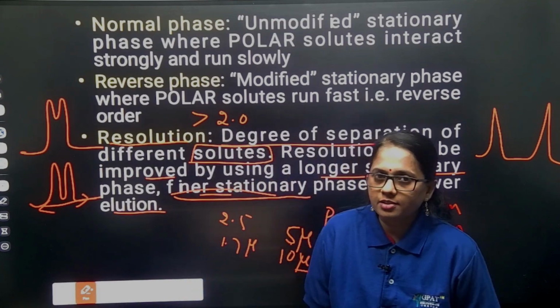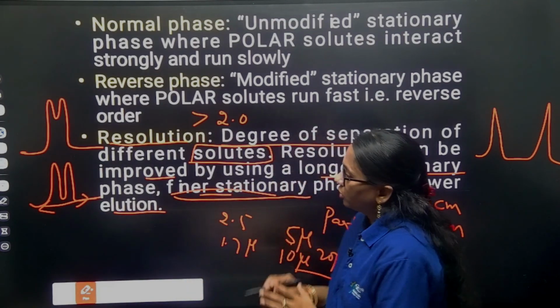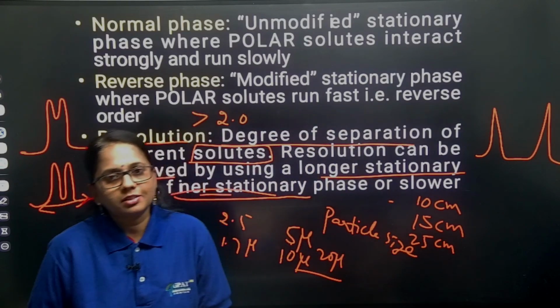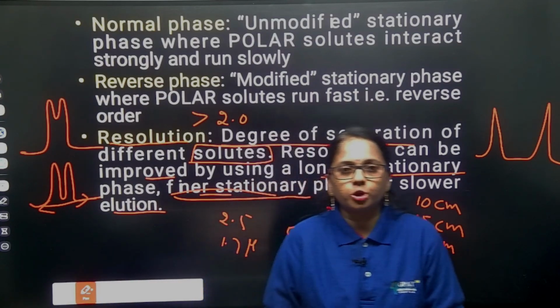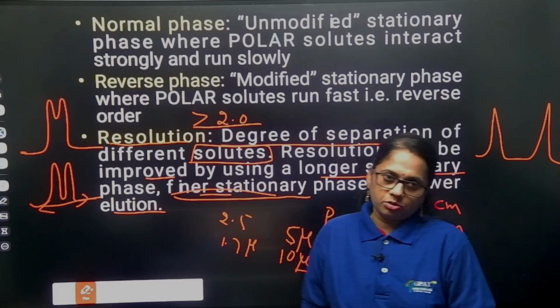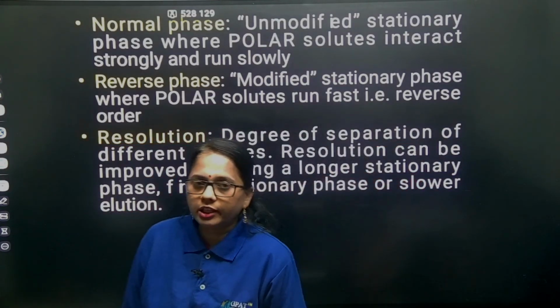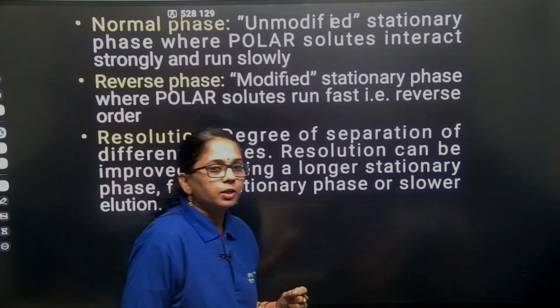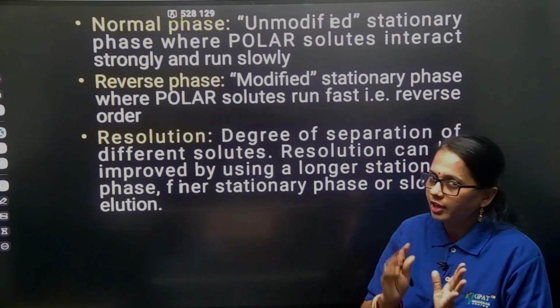It should not be less than 2.0 for any type of method. Even though placebo peaks or any other degradant peaks are also there, the two different peaks should be separated by a factor of 2.0. Resolution is unitless and it can be calculated with a specified formula. According to the pharmacopoeial limits, more than 2 is required between any closely eluting peaks.